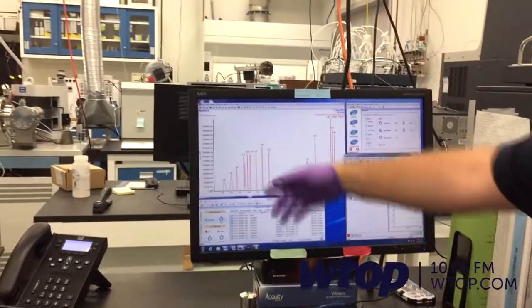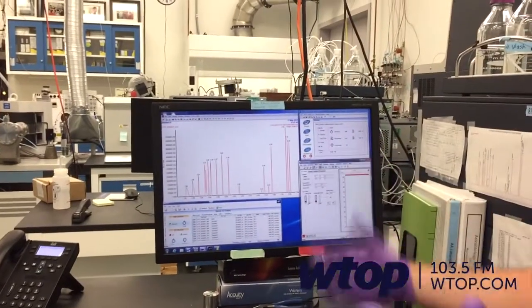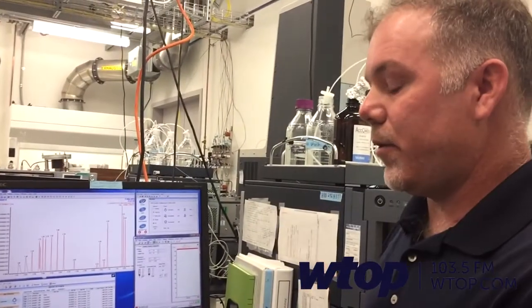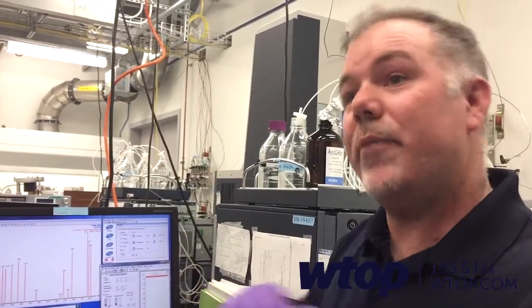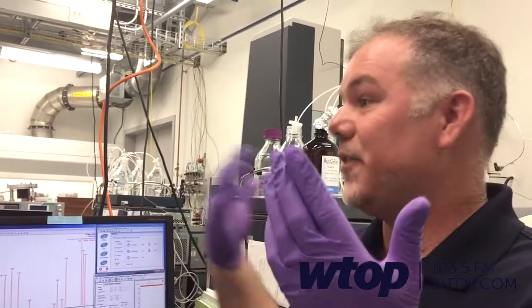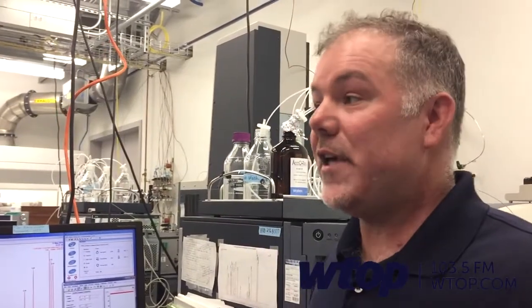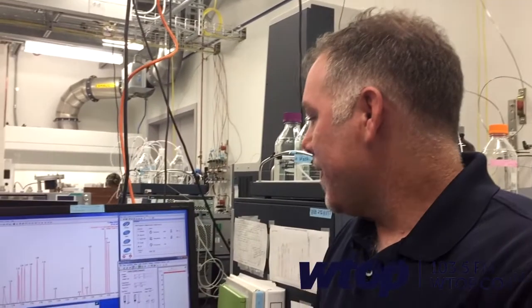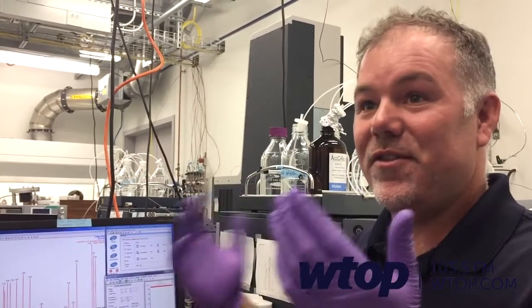The data spits out and you see a bunch of peaks — each peak is an amino acid. We can measure the area under the curve and get a concentration. One unique thing about our approach is we can also separate out the enantiomers of amino acids. We're made up of 20 amino acids; glycine is achiral, but the other 19 are chiral, so they come in left and right handed forms. Interestingly, life uses basically only the left-handed form, and we think this is a universal property of life. Most meteorites have equal mixtures of left and right handed forms — racemic — because when you do these reactions non-biologically, there's no preference of one over the other.